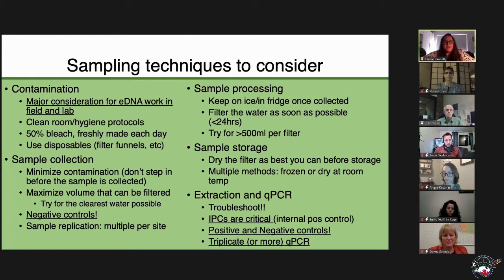When you're picking up DNA from a pathogen from environmental samples, you're looking at such low quantities of DNA that you do really need to be super careful, because you're going to be able to pick up contamination a lot more readily than you would doing other types of DNA extraction and testing.